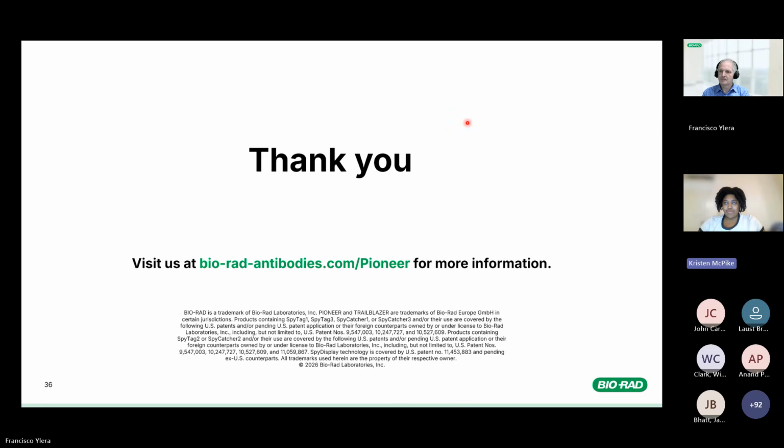First question is from Tong Yang, who says, how was your library generated, protein or cell immunization? And what's your opinion on synthesis nanobody sequences in the target validation?